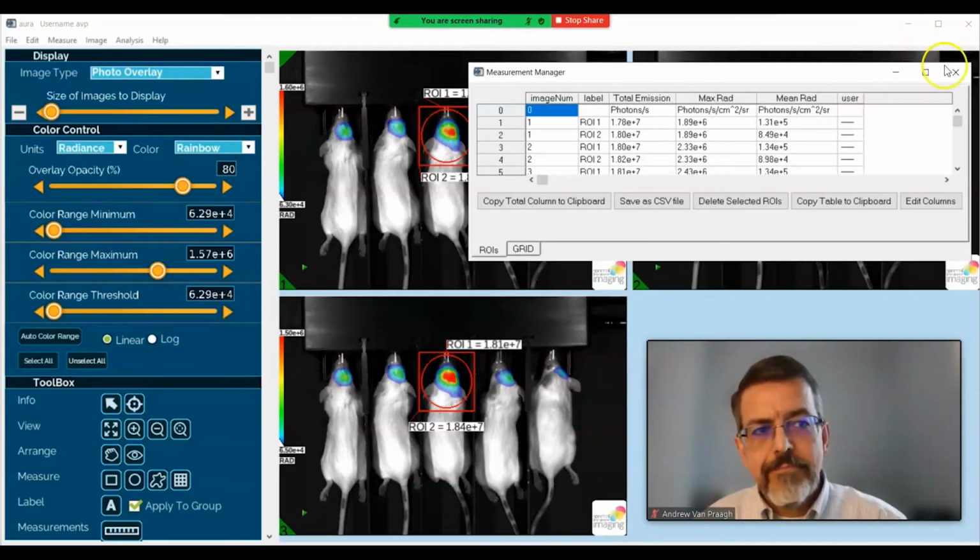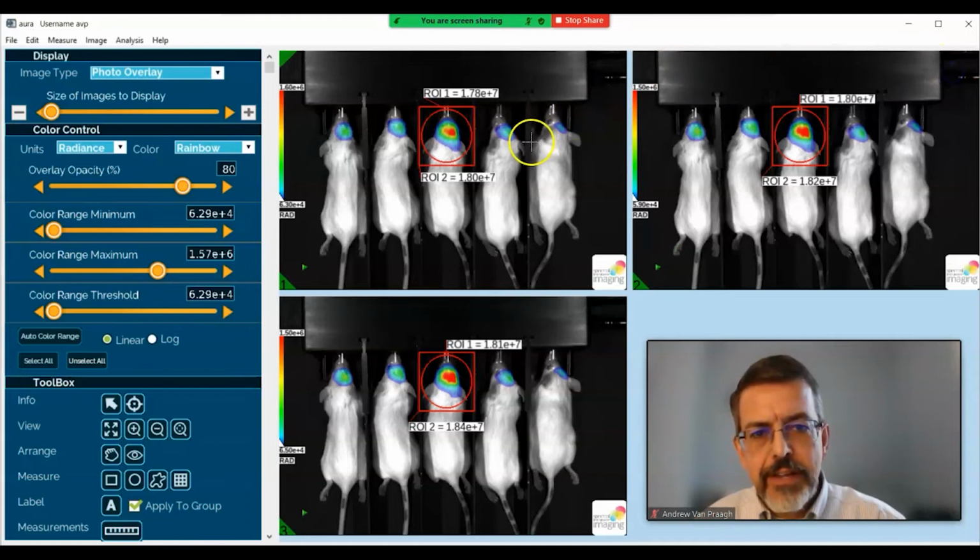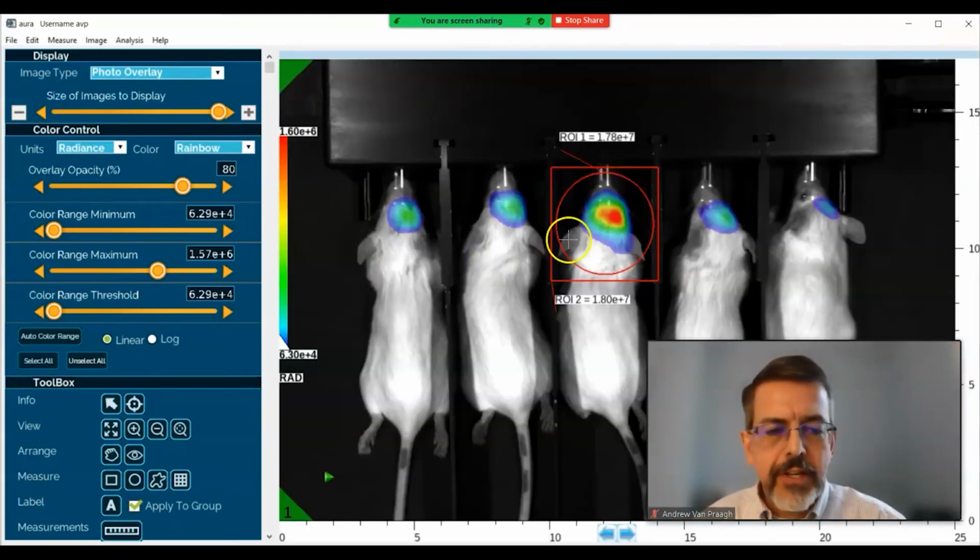So, what is causing this shift in value? Let's take a closer look at these two different ROIs. What you can see is that the circular ROI fits within the square ROI, and both are, of course, measuring the signal. However, there are more background pixels in the larger ROI2 than there are in ROI1.